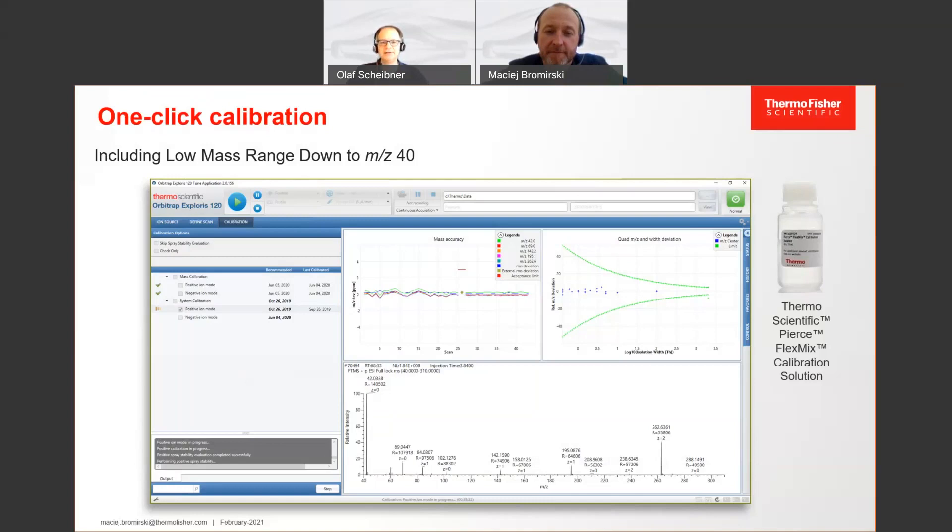As you may see here in that screenshot, our lowest mass to calibrate is m/z 42. So we really calibrate down to the lowest mass available. With that, you have the full mass accuracy over the full mass range from m/z 40 up to m/z 3000, which is the maximum on the Exploris 120.